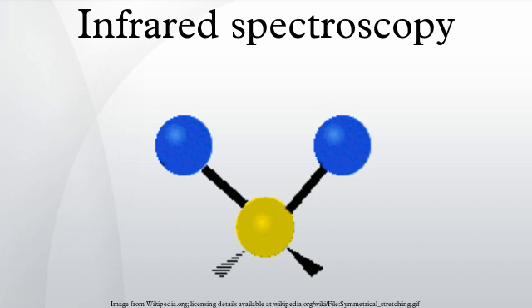The sample is first dissolved in a suitable, non-hygroscopic solvent. A drop of this solution is deposited on the surface of a KBr or NaCl cell. The solution is then evaporated to dryness and the film formed on the cell is analyzed directly. Care is important to ensure that the film is not too thick, otherwise light cannot pass through. This technique is suitable for qualitative analysis.